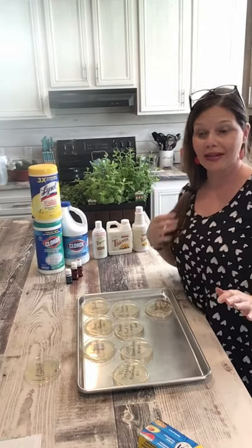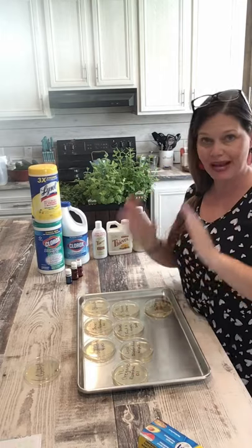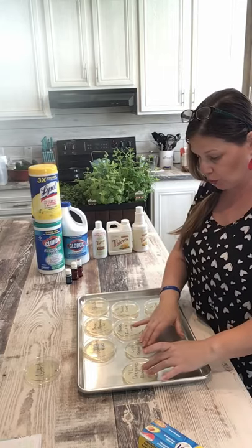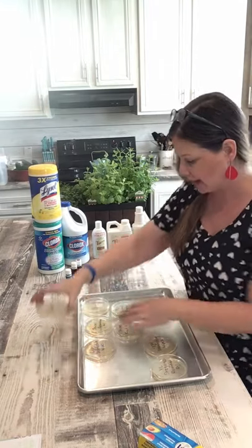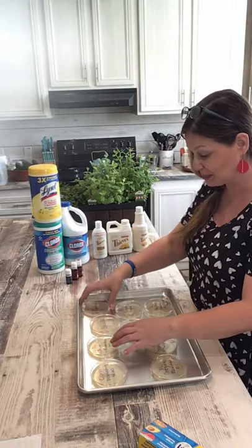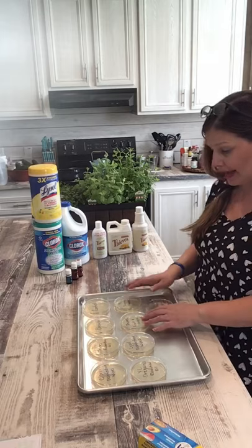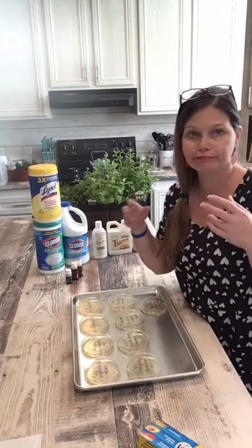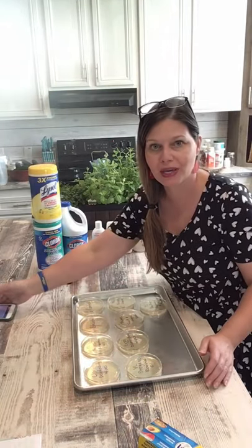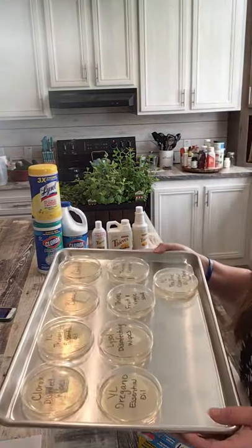Now that they all have the bacteria from the boots and the toilet, I am adding the control back — I was nervous about mixing it up. Now they have to kind of bake or cook. I've heard anywhere between two days to a week, so I will check on these daily.